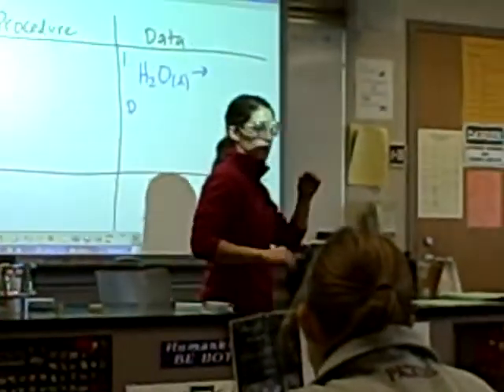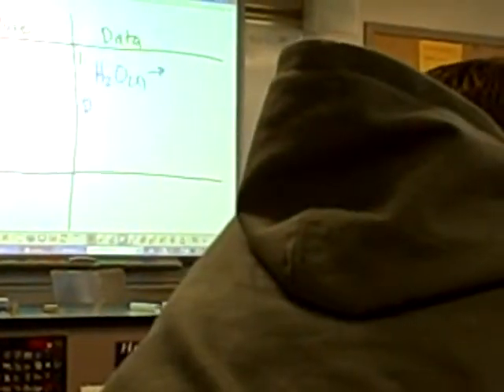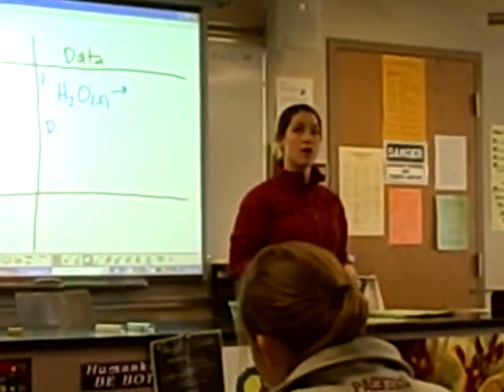Okay. Moving on to the second one. Put it into the tube. Okay. It proves that it has hydrogen or something.